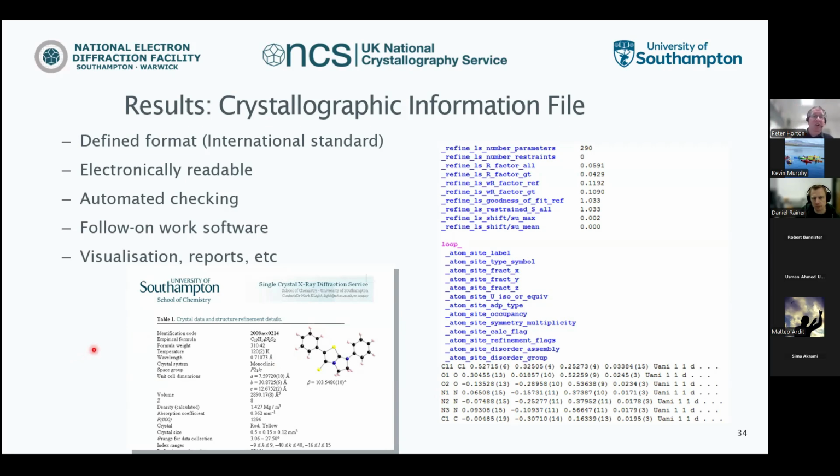And there's various checks to make sure that everything in the structure does make sense. But the final thing, hopefully, is an output where we've got the information, we've got the crystal structure. So that was, I hope, a whistle-stop tour of how to get a crystal structure.